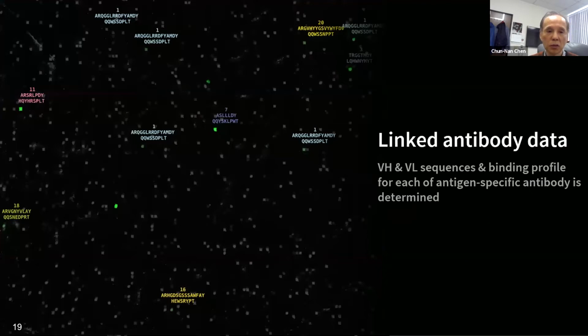And so once you filter away all of the sequences that don't match the stained spots, then what you end up with is the antigen-specific antibody sequences here. So you can see that a particular family started to emerge, that we call family 1 here. And this is family number 11, if you will. And so you can see the power of sequencing everything and combining the information of the antibody binding profiles as well as the phenotypic characterization with the sequence information.